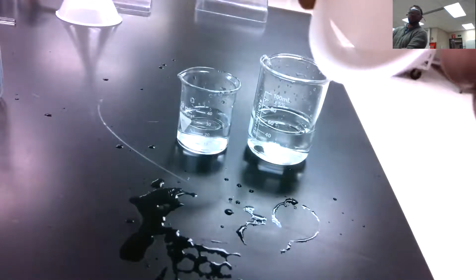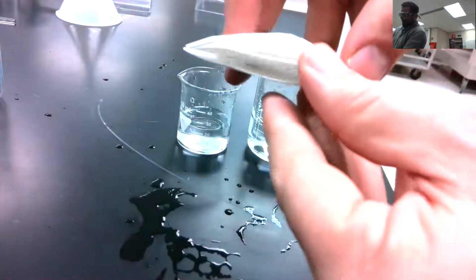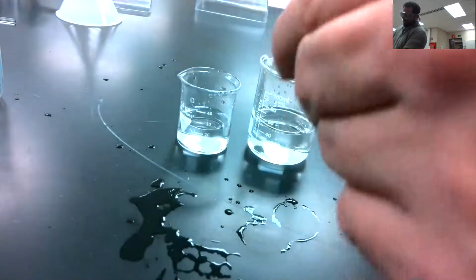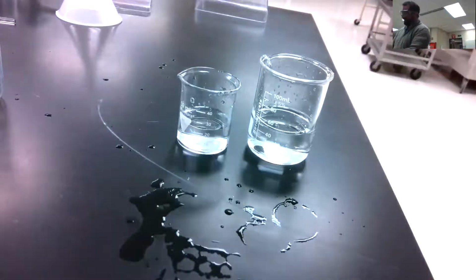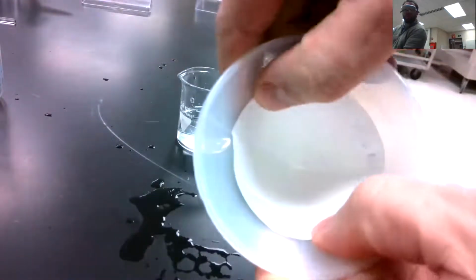That's not going to do anything. We want to catch the solid particles. So again, we only want to open up just 1/4 of it. And that way, no hole down there at the bottom, hopefully. Catch all the solid down in there. I'm going to get my funnel. I place my filter paper in the funnel.